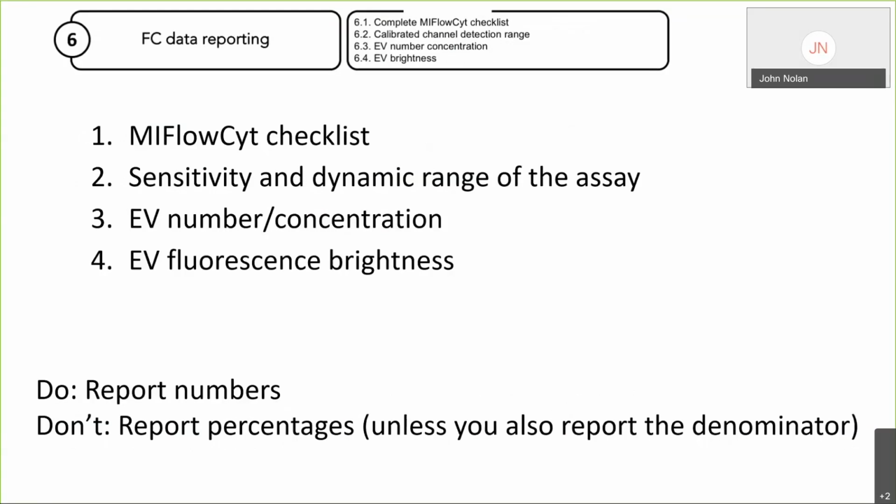Finally, we've interpreted our data. We're going to report it for publication. There is a MIFlowCyt checklist, a general checklist for how to report on flow cytometry measurements. These are additional elements specific to vesicle analysis that should be reported.